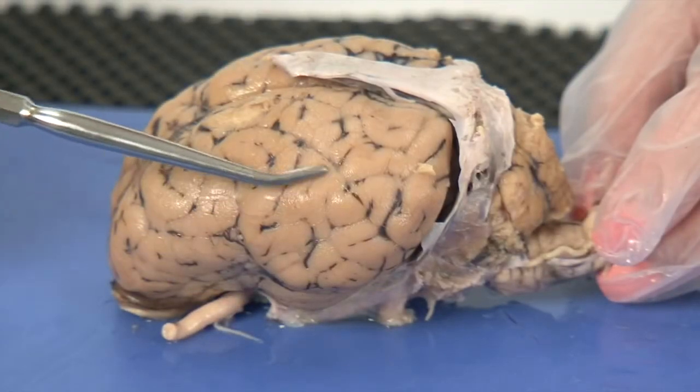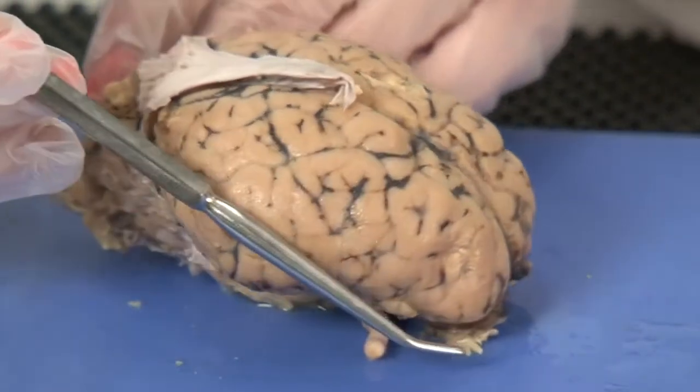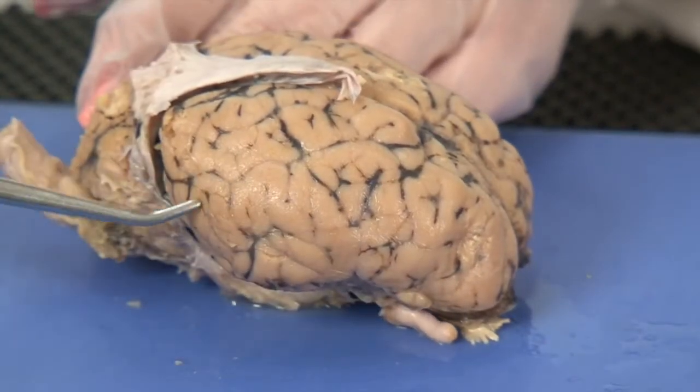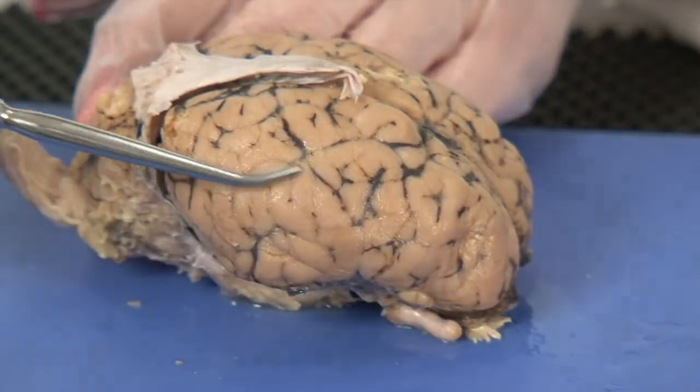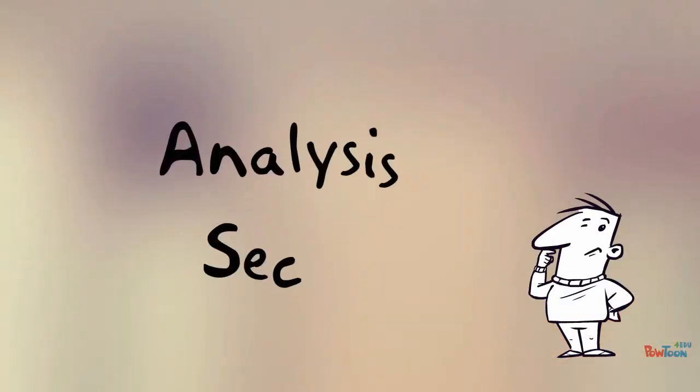Also notice that the cerebrum is divided into the left and right sides. Before continuing, sketch and label all 9 bolded structures. Complete all analysis questions.